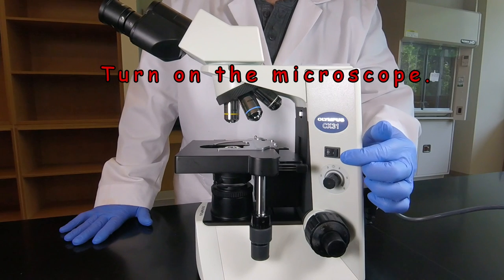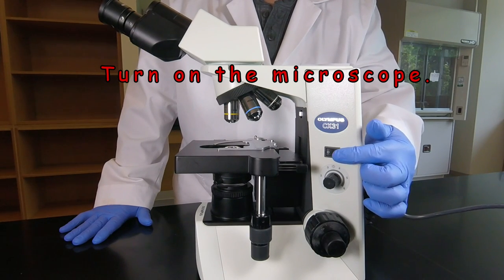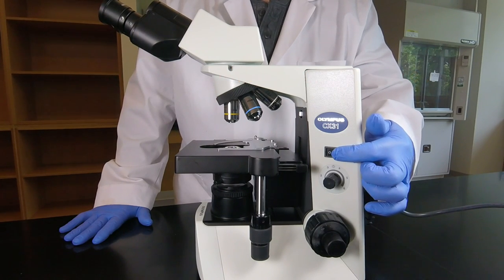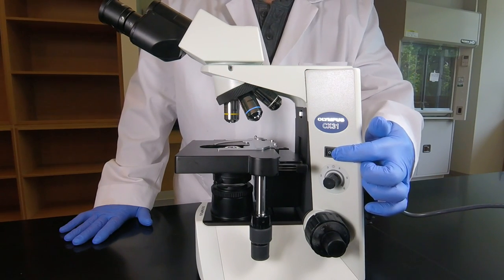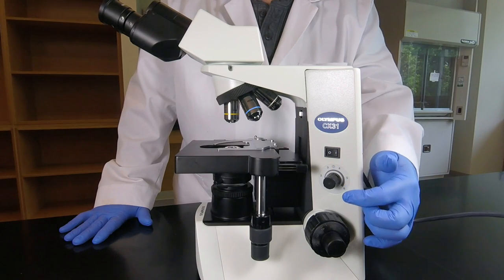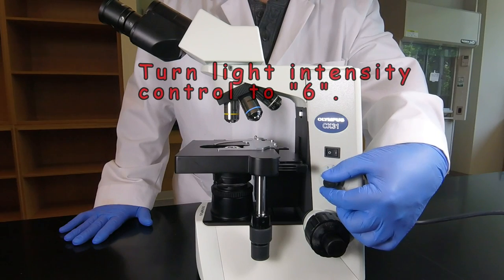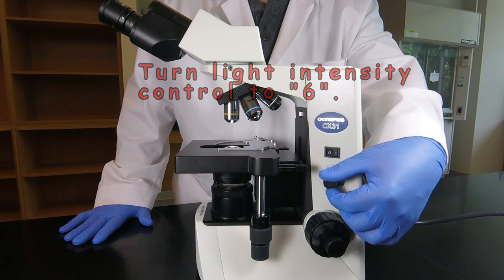And to turn it on, we have an on-off switch right here. So if you depress that, that will turn the light on. And then once the light is turned on, we're going to go back to our light intensity control dial. And we're going to slowly turn that all the way up to six, as high as it'll go.